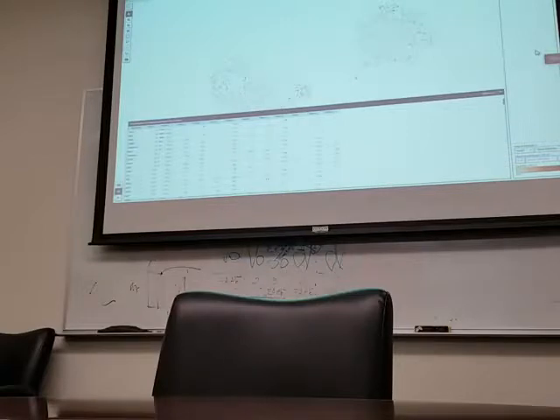TCL1A is hard to see, but interestingly, it's a T-cell leukemia gene, but it's in B cells. Somehow, that's how things get a bad name. Are these B cells? It was unclear to me if these are B cells. I thought these were just PBMCs. No, TCL1A, they're B cells. For example, I'm over there. I got a lot of B cells.